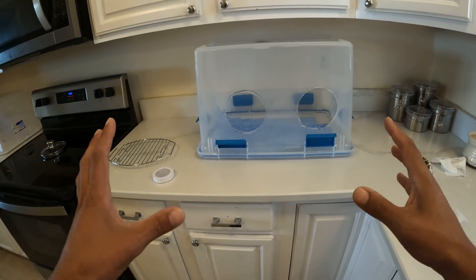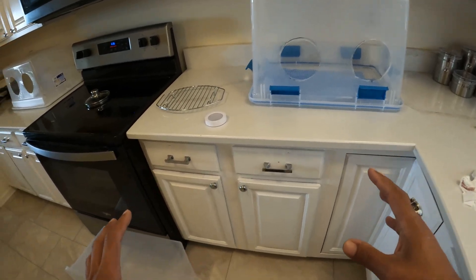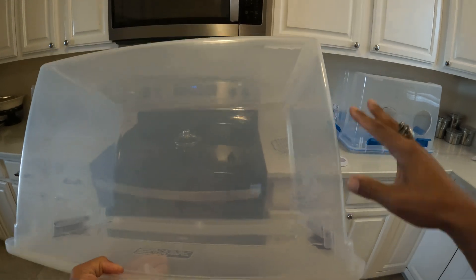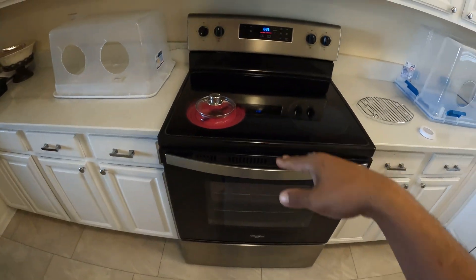Hey everybody, Brandon here — I see fungi. Let's get straight to it and make a steel airbox at home. What you want to do is get one of these containers. This is a 66 quart — ideally the bigger the better. That one's bigger, we'll get to that in a moment, but I want to show you how easy it is to just get going. Let that heat up real quick.